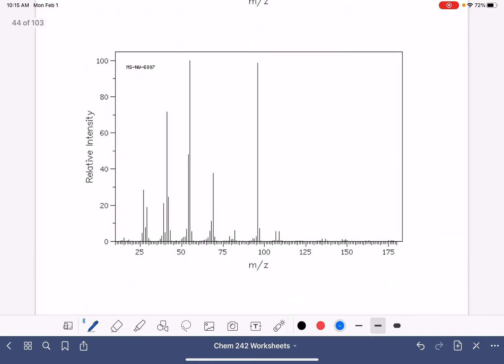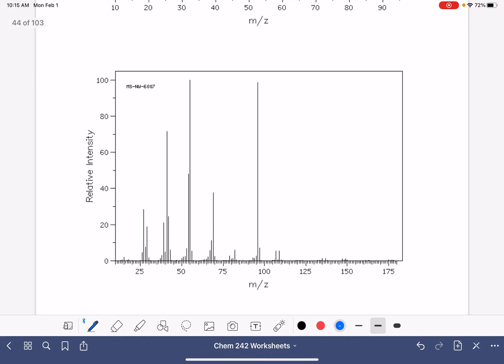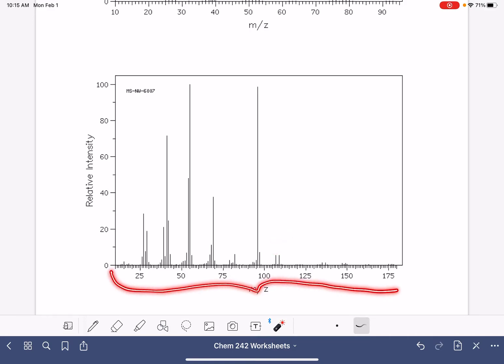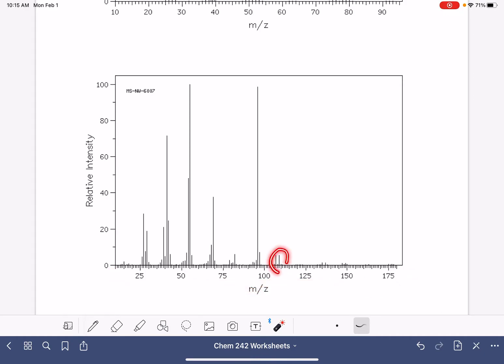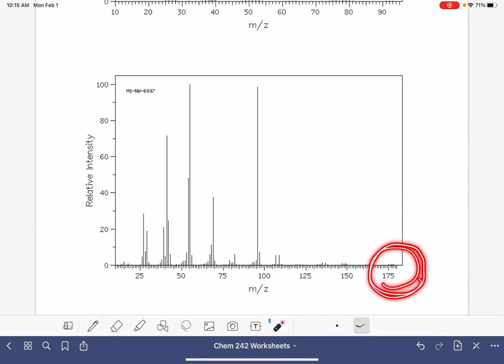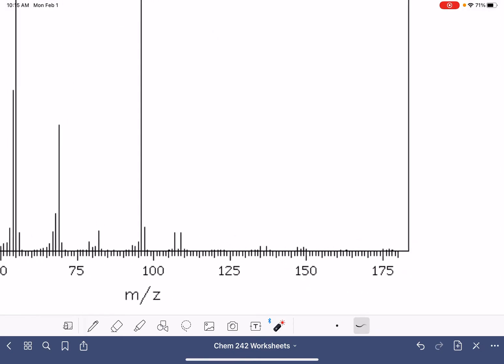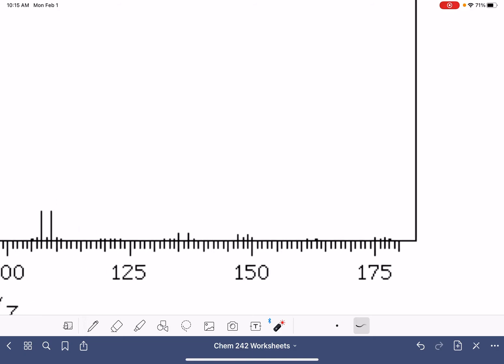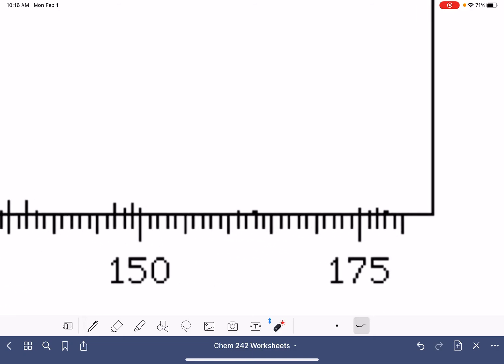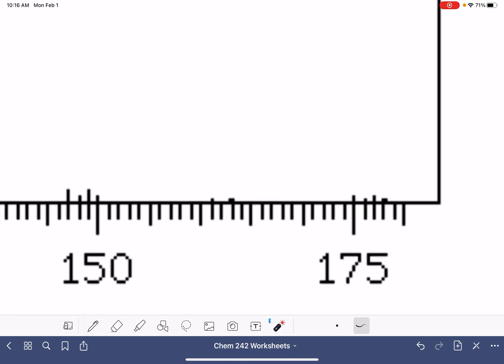This next spectrum, you might have your eyes drawn to just this portion right here as being the M plus peak. But keep in mind that the axes on the mass spectrum adjust themselves to fit the data. If these were the molecular ion peaks in the molecule, it would not continue to have an axis that continued all the way out to 175. If the axis goes this far, you better pay attention to what's going on out there.